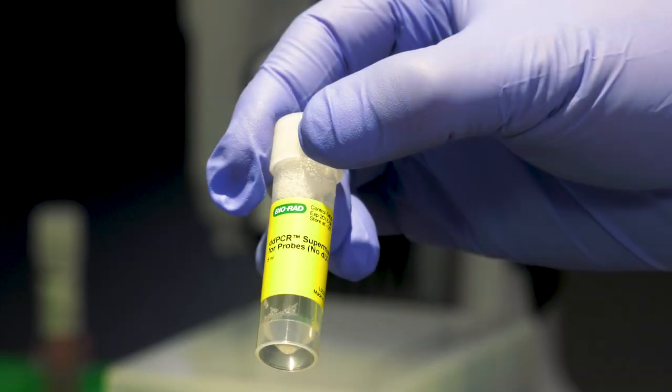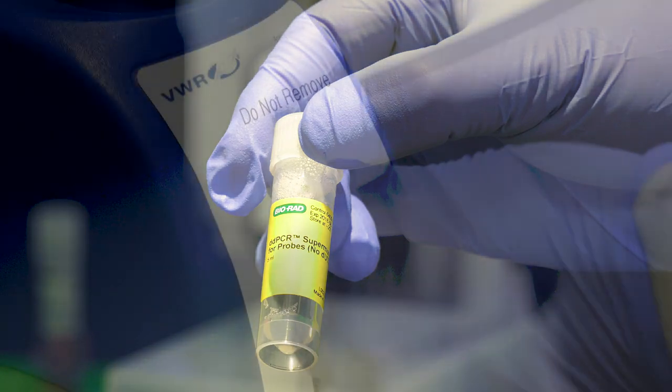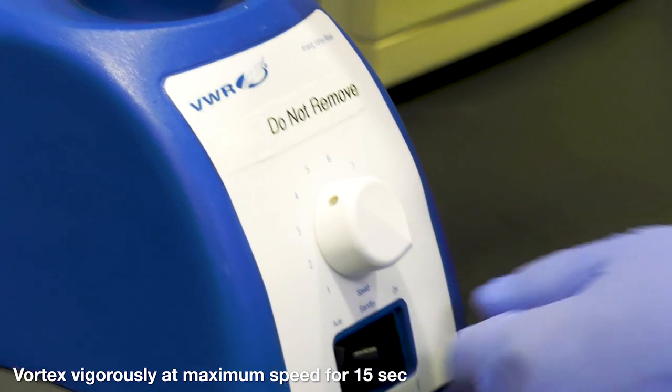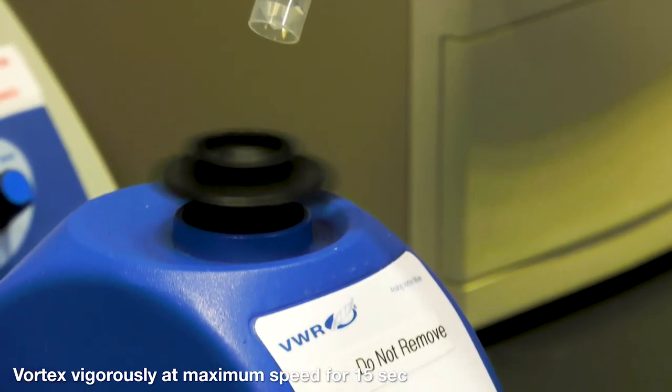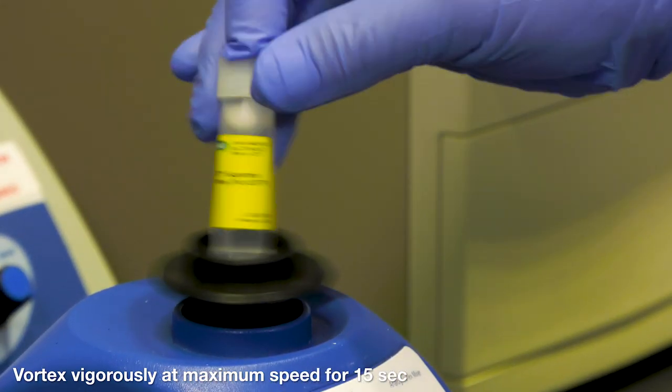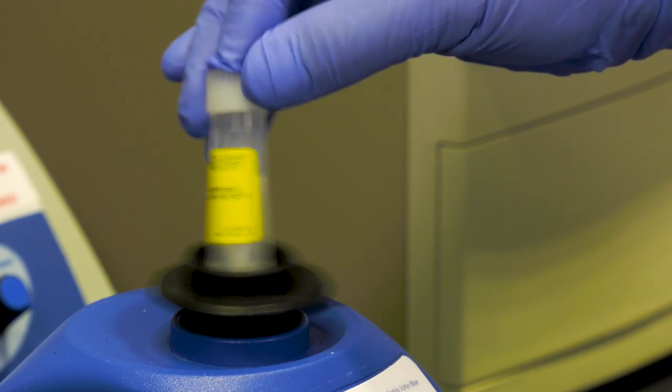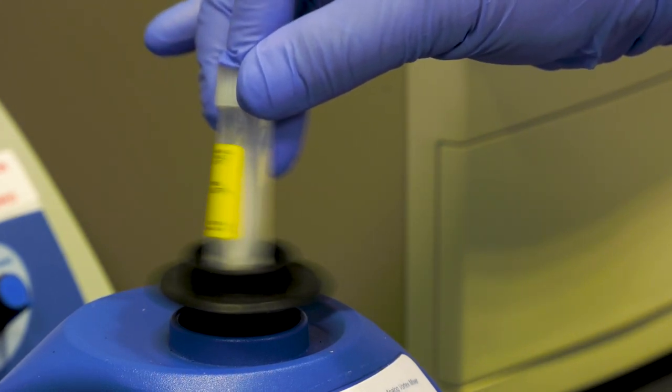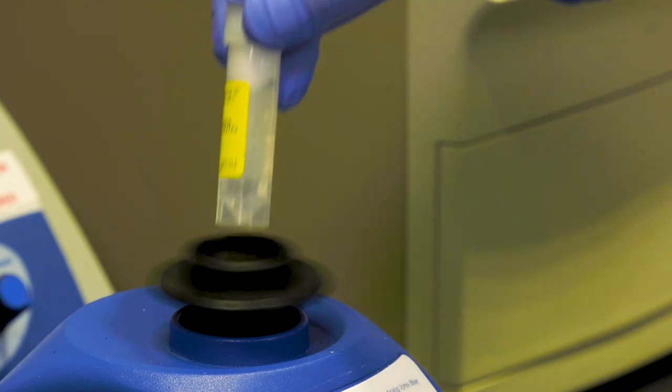Once the SuperMix is thawed completely, you may notice some precipitate at the bottom of the tube. In order to eliminate any separation or gradient, vortex the SuperMix at maximum speed, which is 3200 to 3500 RPM, for 15 seconds. Make sure any precipitate goes back into solution. The SuperMix can handle vigorous vortexing without damaging it.